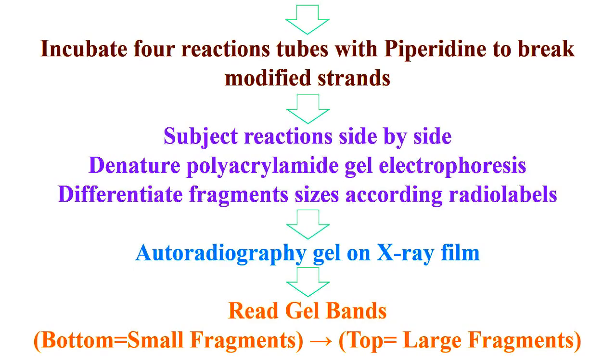And incubate 4 reaction tubes with piperidine to break modified strands, and subject reactions side by side in denaturing polyacrylamide gel electrophoresis to differentiate fragment size according to radiolabels, and autoradiography gel on X-ray film to read gel bands from bottom to top, as mentioned in next slide.